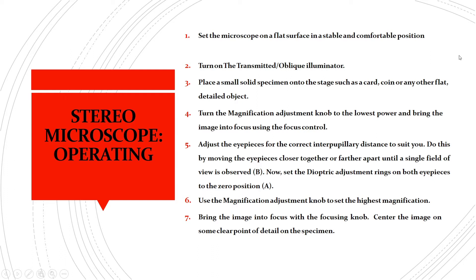To operate a stereomicroscope, first set the microscope on a flat surface in a stable and comfortable position. Then turn on the transmitted or oblique illuminator. Unlike a compound microscope, the light source is already built into the microscope base, so you simply turn it on.